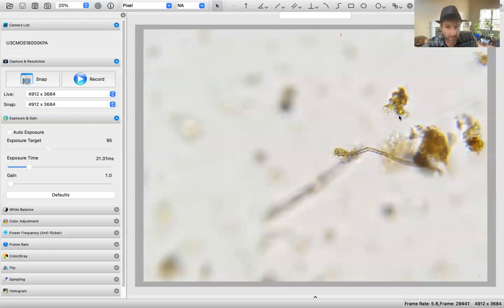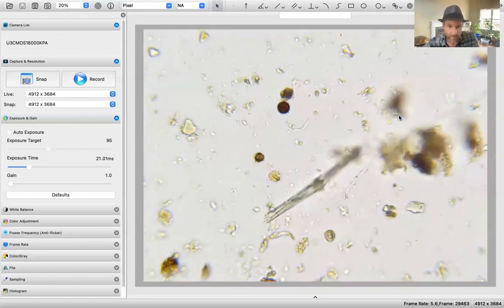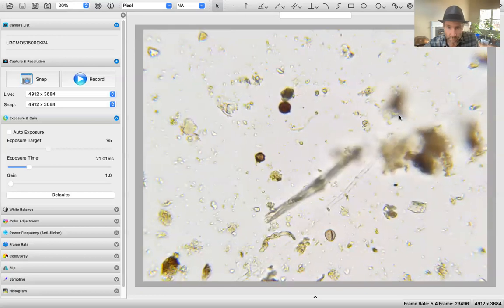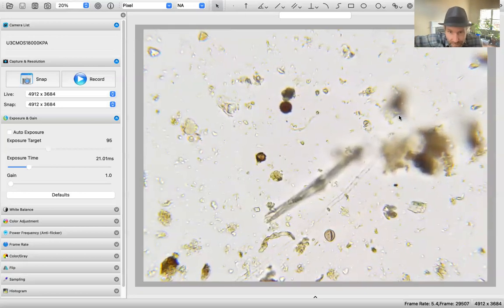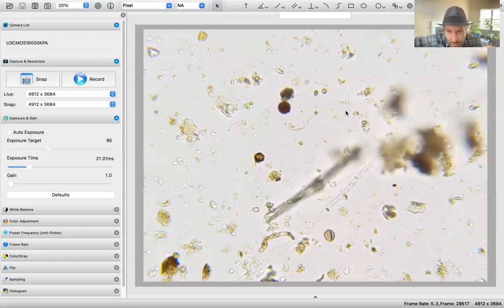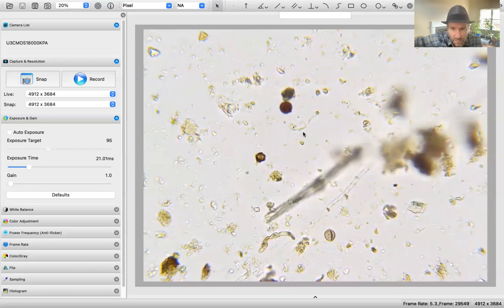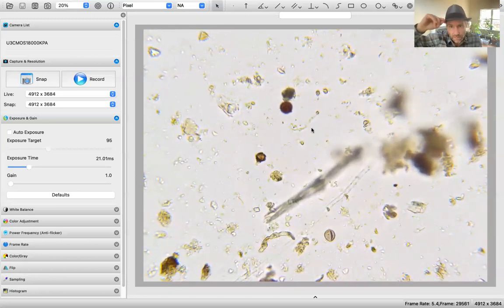Before I go forward, let me double check because there may have been a flagellate pop up and zoom right through. They do little zoomies. This is not uniform. Actually, it's pretty close. It looks more like a fruiting structure of maybe a zygomycota.